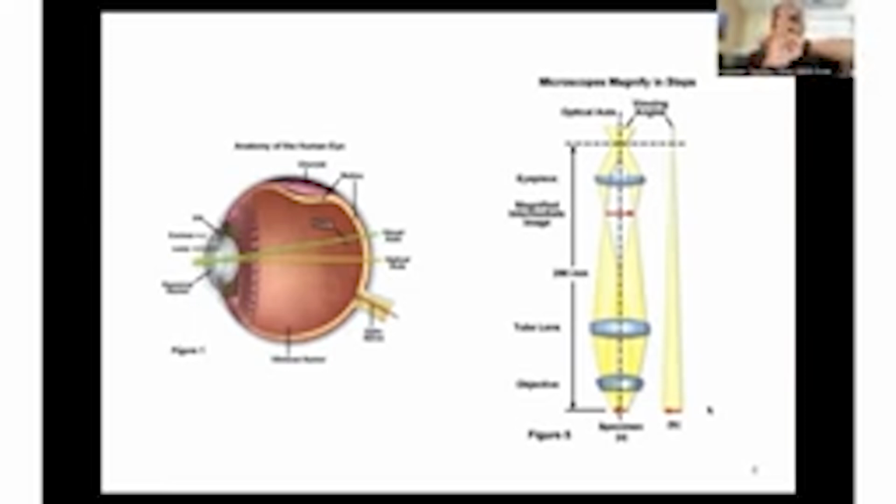And now this image is transmitted in such a way that you can see it on a computer screen, right? So the idea of the eye as an analogy is that along with objectives that are present, there is a sensor that actually responds to the light that is being focused.